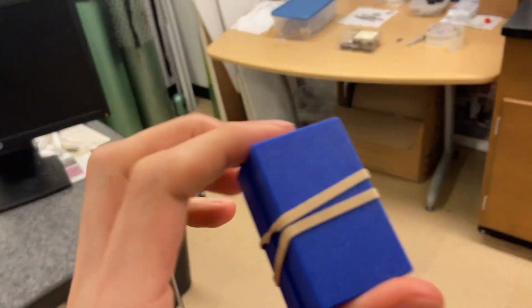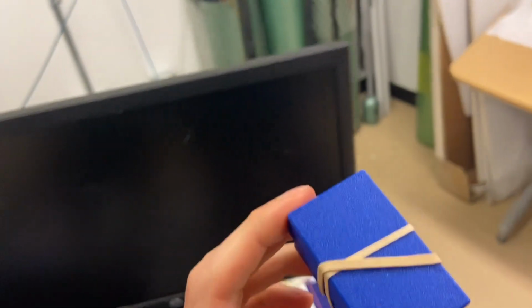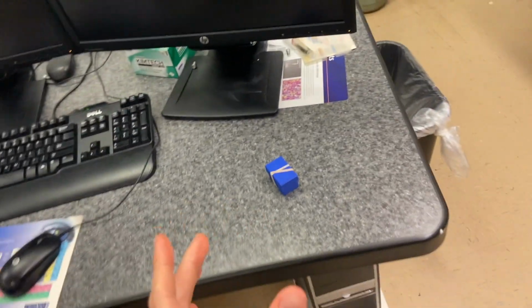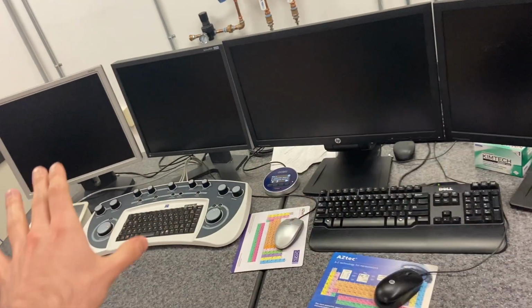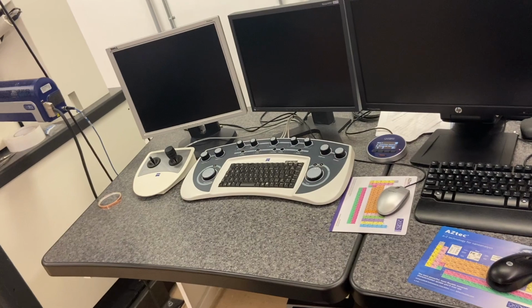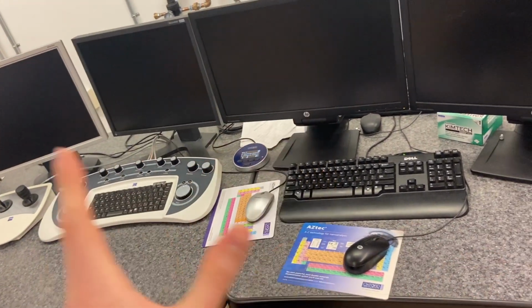So first things first, I've got my thin sections containing, well, essentially what the meteorites are on, but this is my box containing the thin sections. What I need to do is first get this onto a holder, which I'm then going to insert into the SEM, which also requires me to turn on all this equipment, which I'll do very soon. And once it's in there, we can pretty much do the analysis.